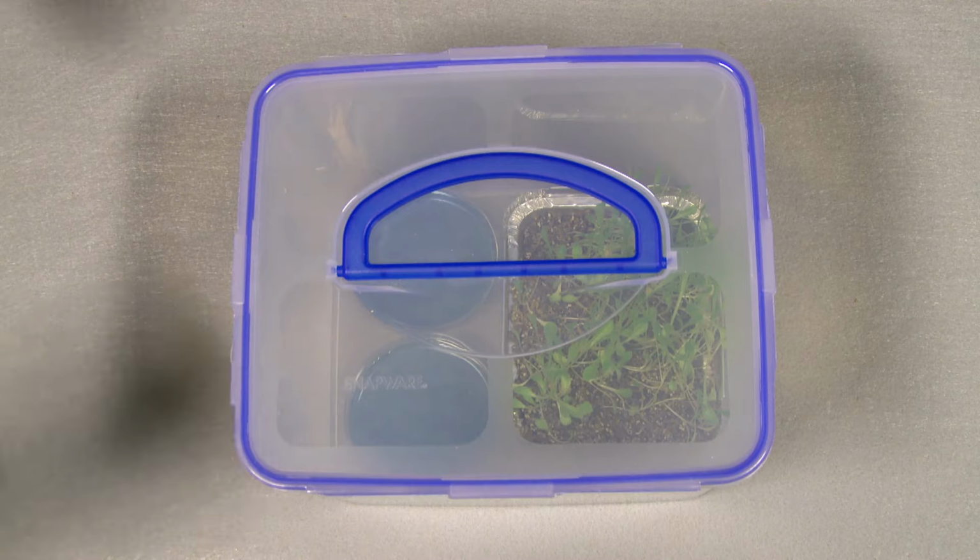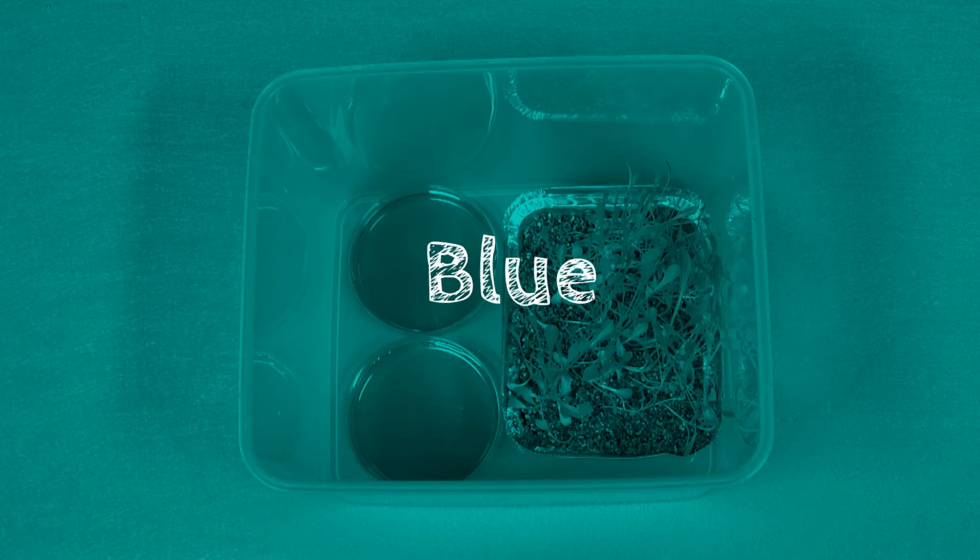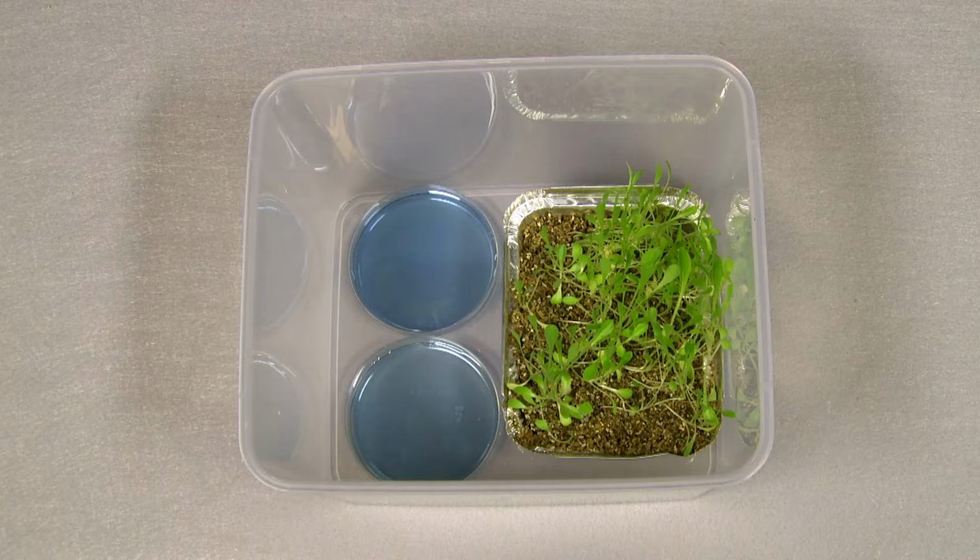And here are our little green friends. You'll notice that the BTB is blue. That indicates a decrease in CO2. Did that match your prediction? Where did the carbon dioxide go? The CO2 must have gone somewhere.